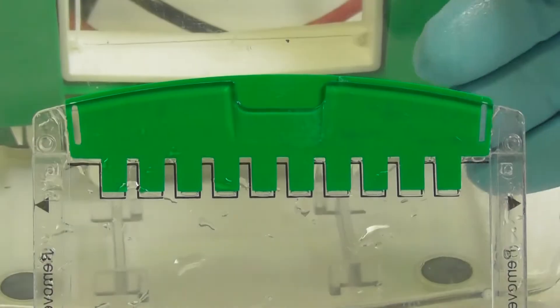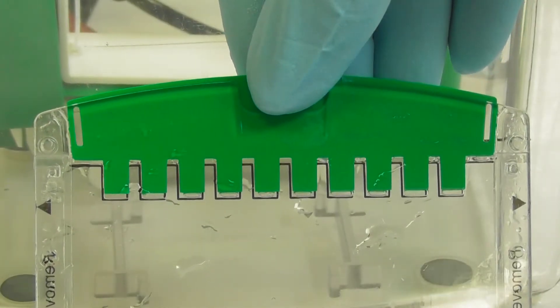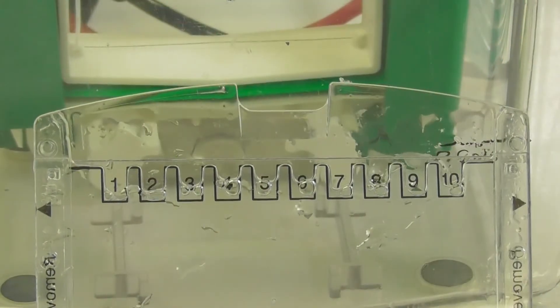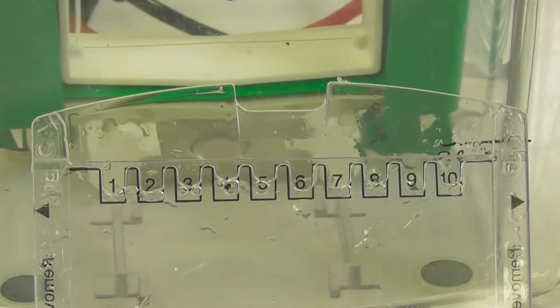The top of the precast gel has the comb which is seated in the wells and this must also be removed before use.